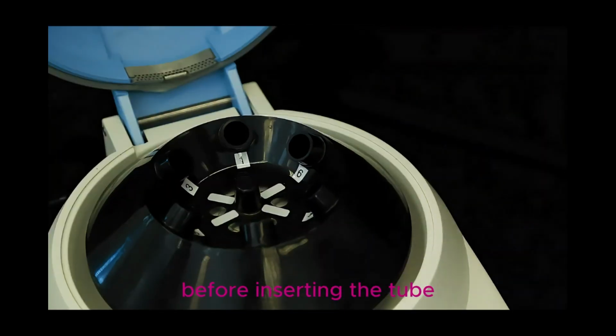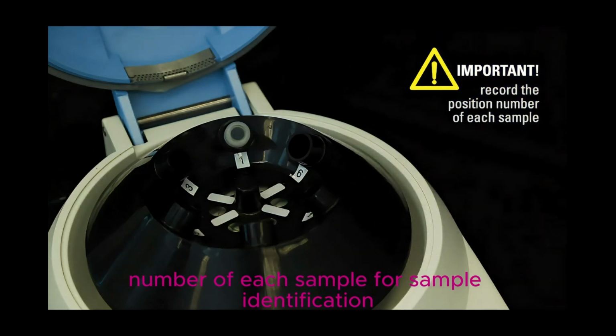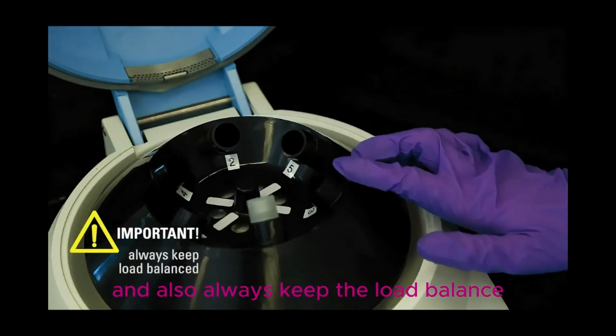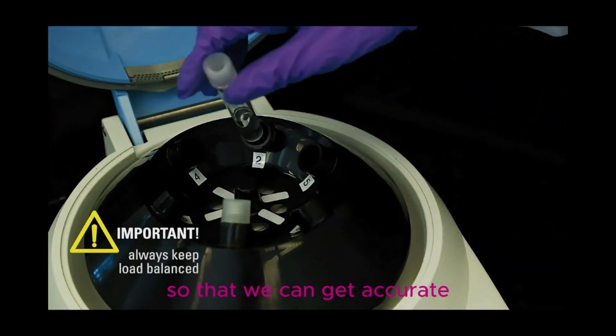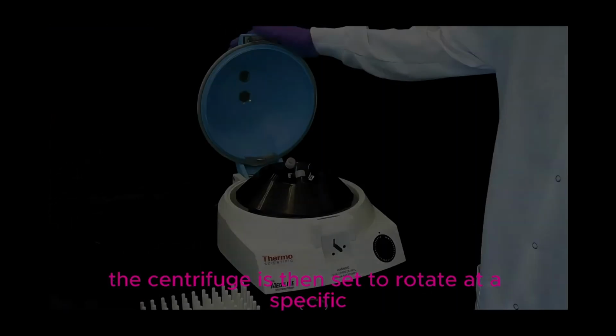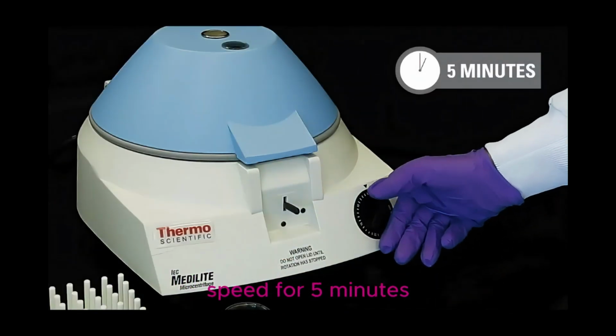Before inserting the tube, we need to ensure that we record the position number of each sample for sample identification, and also always keep the load balanced so that we can get an accurate result at the end of the experiment. The centrifuge is then set to rotate at a specific speed for 5 minutes.